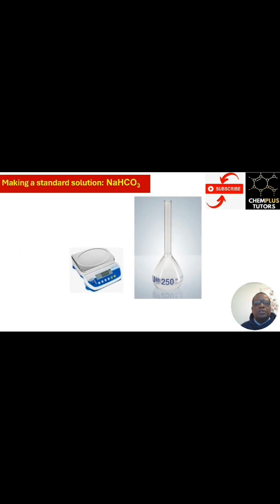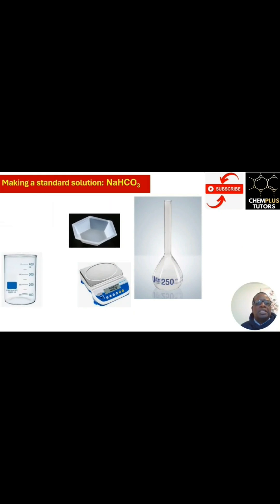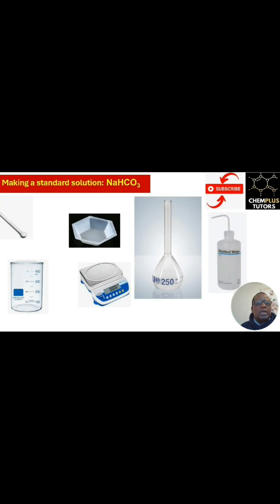Welcome to Kemplus. Today we've decided to make a standard solution of sodium hydrogen carbonate. Here is the equipment we need: a 250 ml volumetric flask, a balance, a weighing board, a beaker, distilled water, and a glass rod.